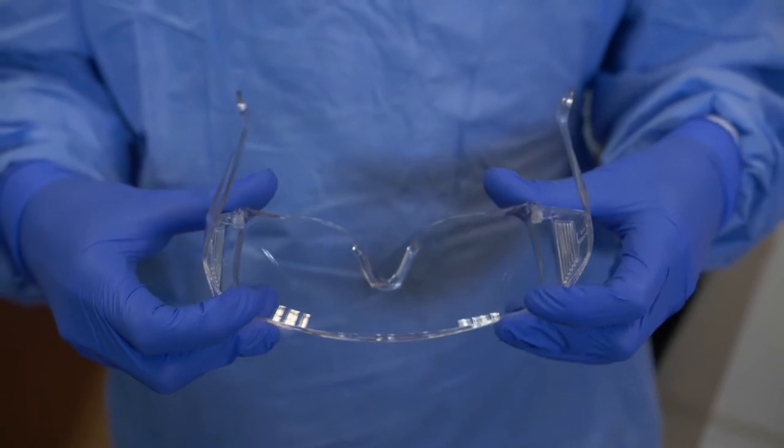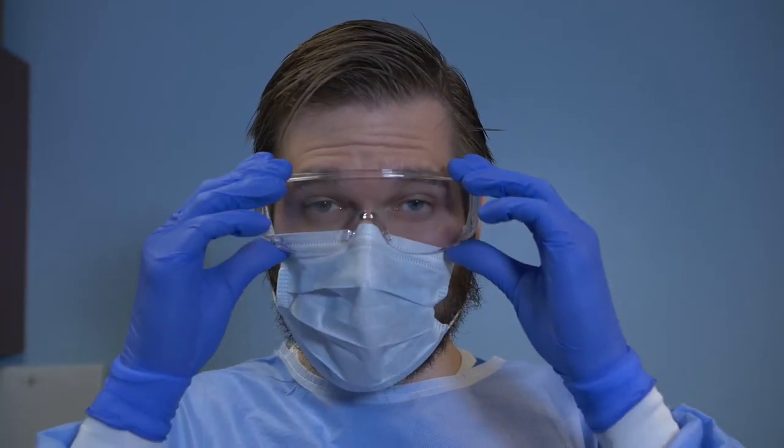Apply protective glasses, goggles, or shield comfortably over your eyes and check that your vision is clear. Be sure the eyewear fits snugly around your forehead and face.